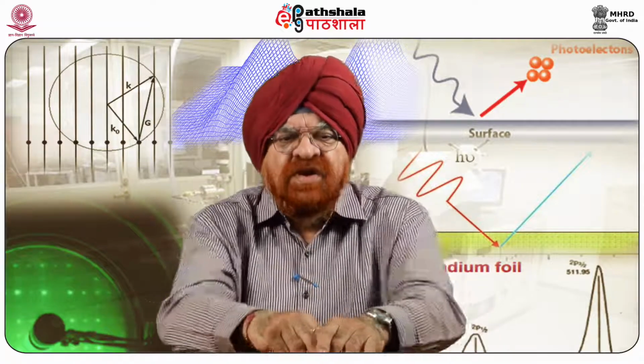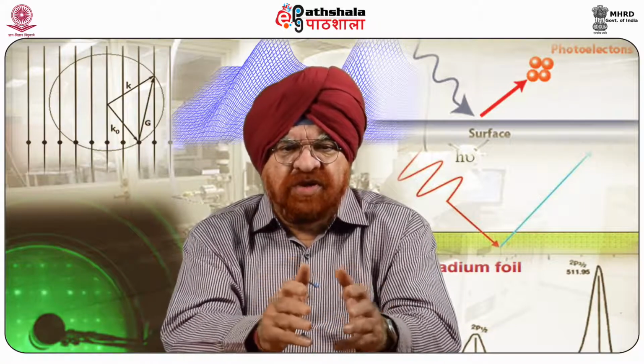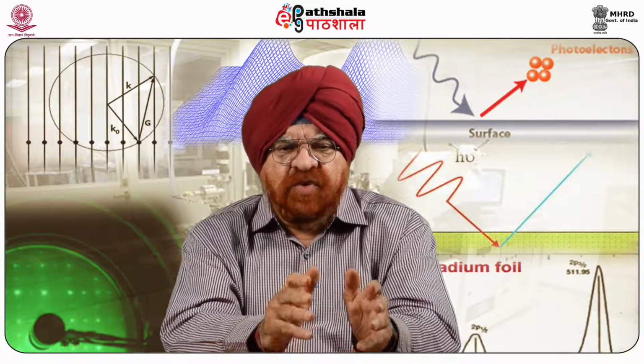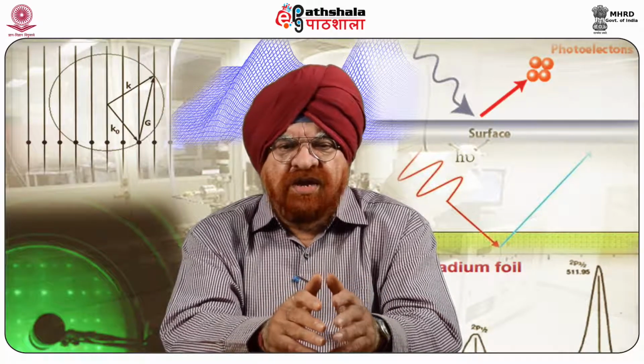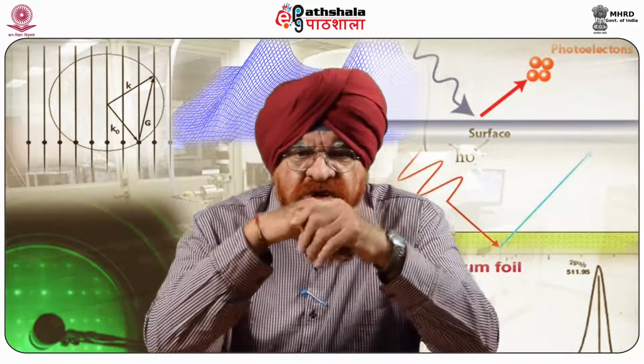So, students, after giving you the introductory part of AFM, now let us summarize what we have learned in this module. The atomic force microscope is being used to solve processing and materials problems in a wide range of technologies affecting the electronic, telecommunications, biomedical, chemical, automotive, aerospace, and energy industries.